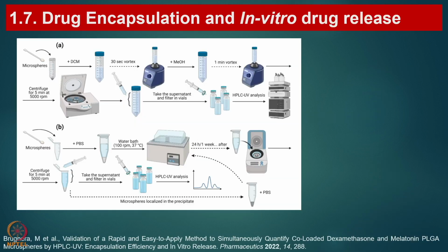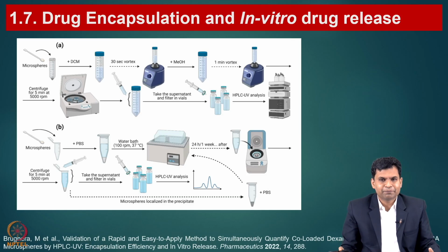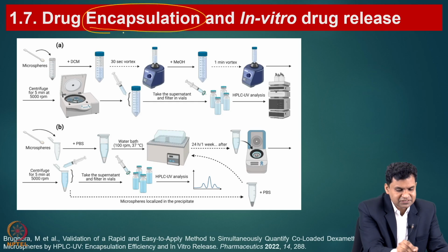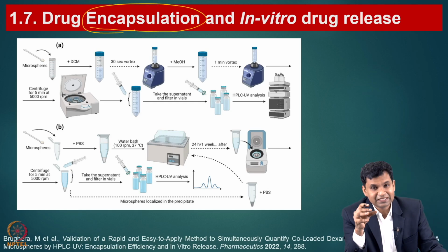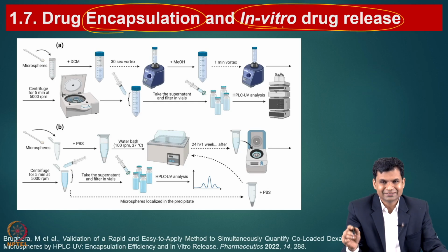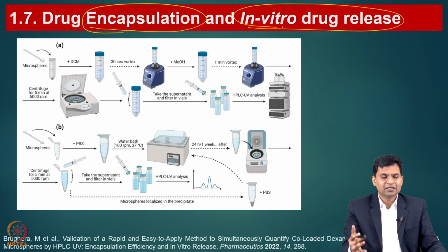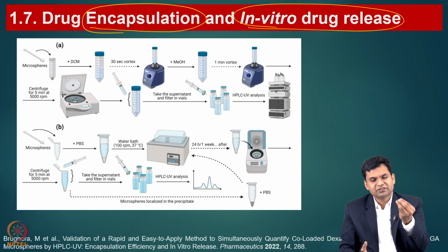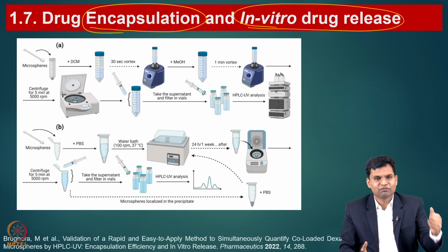Now, the other one is related to the drug, that is, chemical properties. Here we need to identify how much drug is loaded or encapsulated in the formulation. And the second is the in vitro drug release. This is not like dissolution studies, because we work with a very small quantity, and it needs to be performed in the simulated pH conditions of the tear fluid.